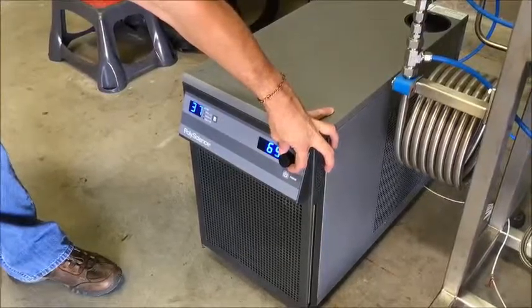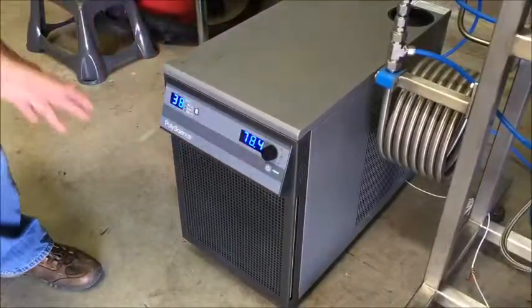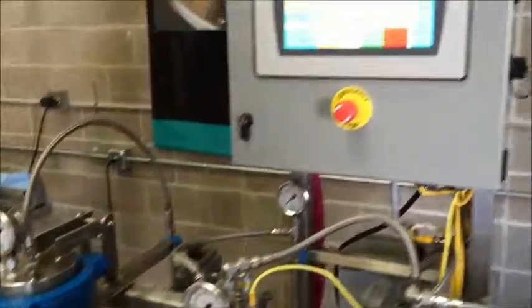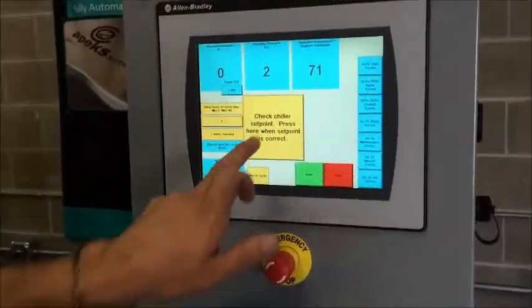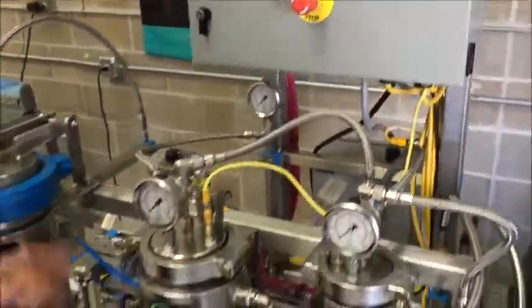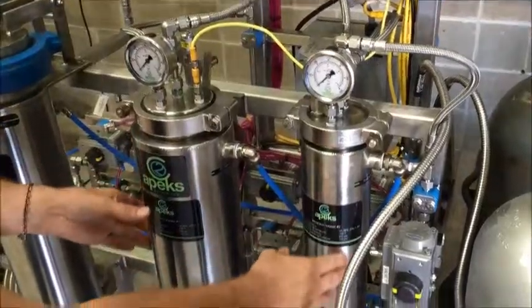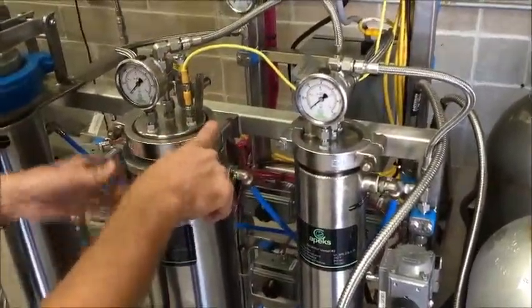Next it says to check the chiller set point — it's reminding us to set a temperature on our chiller. Right now we have it in Fahrenheit and we're going to turn the power on; it's 75 degrees Fahrenheit. If you're running lower pressures and lower temperatures, 55 to 75 is a good temperature range. If you decide to run higher pressures and temperatures, we recommend around 100 degrees Fahrenheit on the chiller. After we've set our set point, we acknowledge.